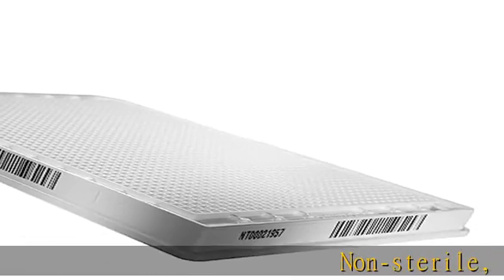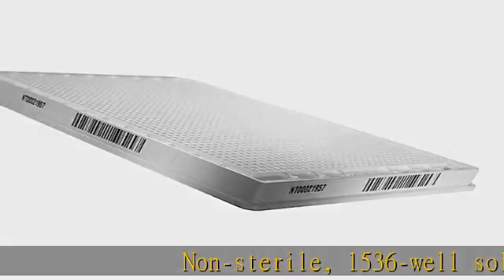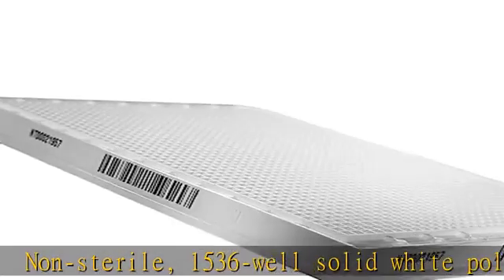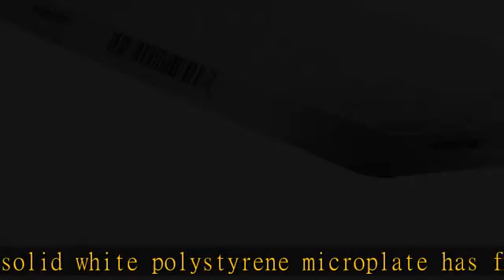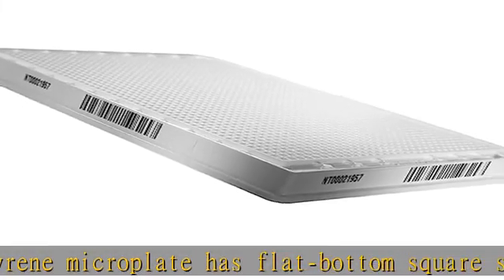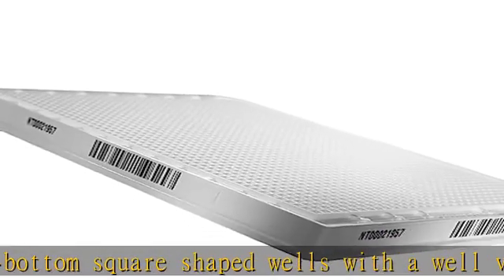Non-sterile, 1536-well solid white polystyrene microplate has flat-bottom square-shaped wells with a well volume of 12.5 µL and a recommended working volume of up to 8 µL. Excellent signal dynamic range due to low background fluorescence and enhanced signal intensity.